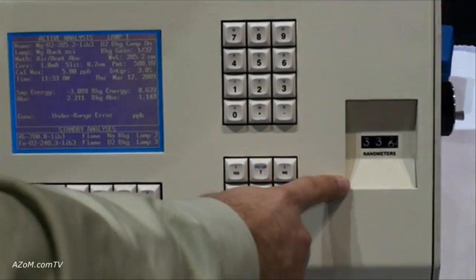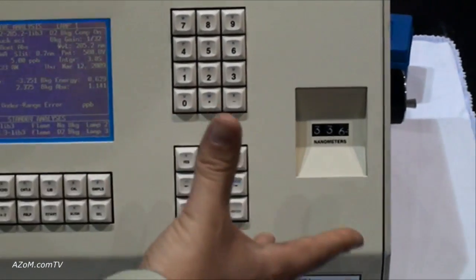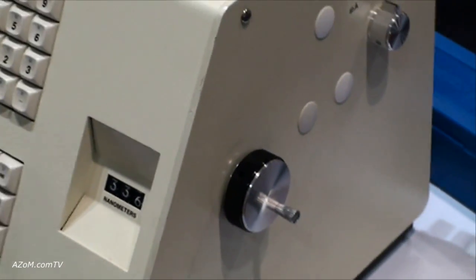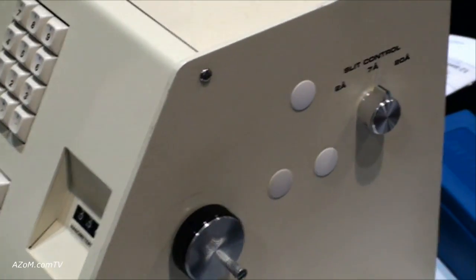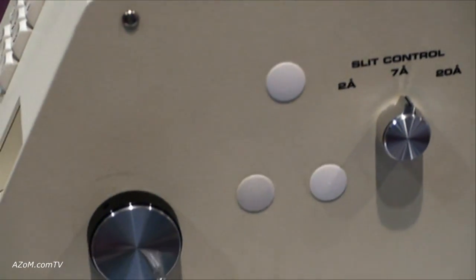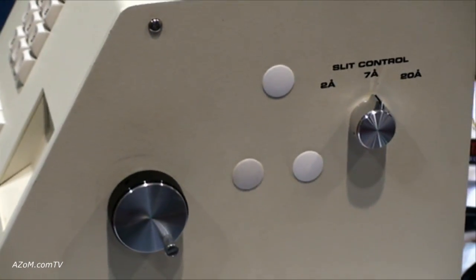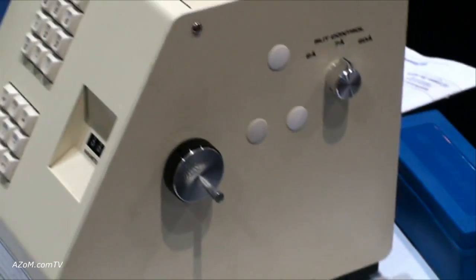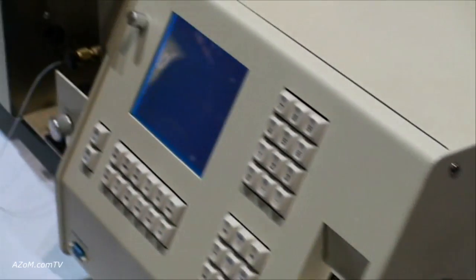The monochromator is right here — it's manually adjusted on the side, and the slit width has three options over here. This is an excellent point for student use, for academic use. A lot of professors and teachers like to have students actually dial in the wavelength to pick the proper wavelength for analysis.